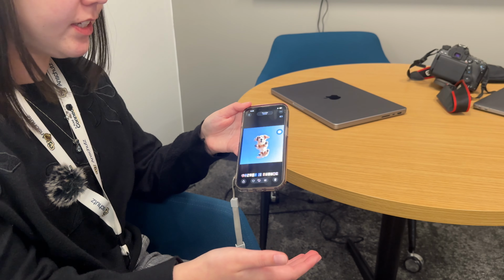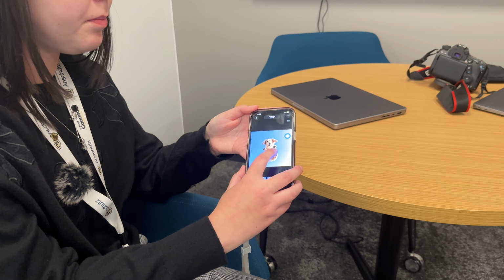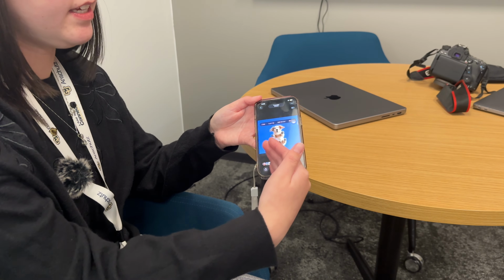So, for example, people with their iPhones can actually segment things and make stickers, but it's easier for a person to do it on one photo because they just click and hold the one photo and it'll segment and outline it. In our case, it is not as simple because we need to do that across hundreds of cells in one image. So we need more complex and sophisticated algorithms to do that.